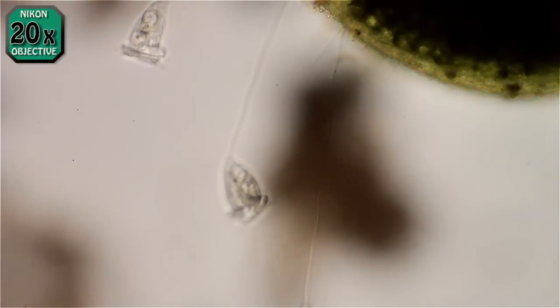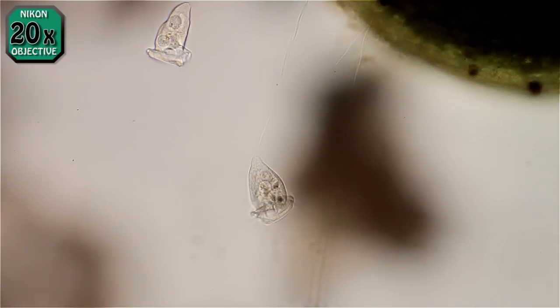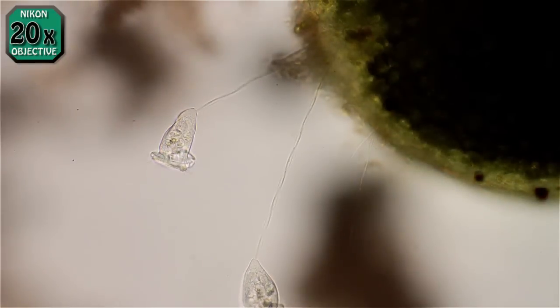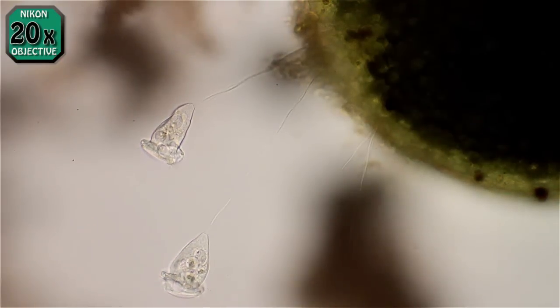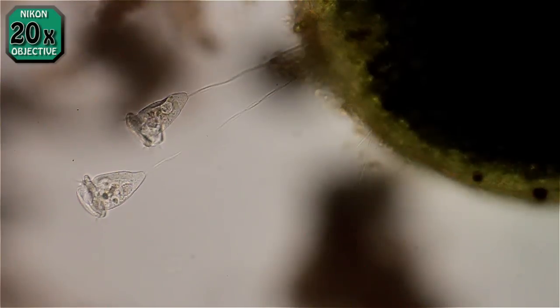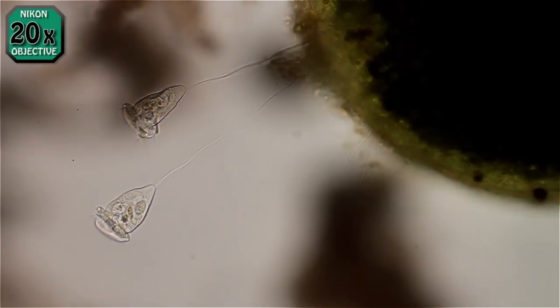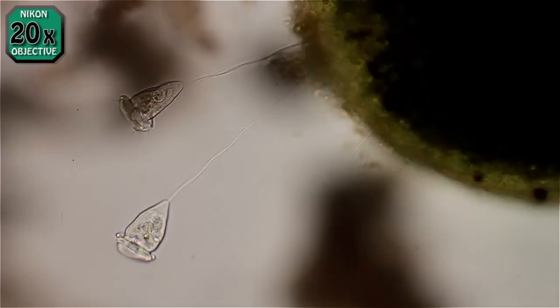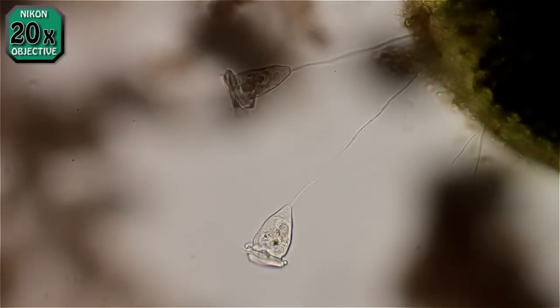These are Vorticella. I'm using a 20x Nikon Plan Apo right now and a Nikon Fluofot flip-top condenser. The big green thing and black thing in the top corner is a piece of duckweed, and the sample itself came from a small pond — not a regular pond. It comes and goes depending on the rain. It's a low spot in the woods filled with leaves and water when it rains for several days or whenever the river comes up.